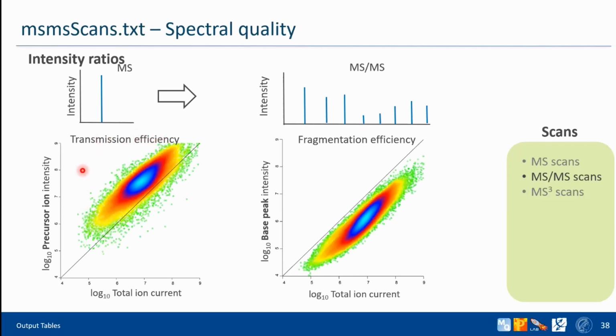Okay, so we have a higher one going toward MS1, here MS2. They should be on this exact line here. So it means that, for example, something happened during MS2 and you were identifying more stuff, more contaminants, more something that was not supposed to be there, or maybe something bad happened before MS1, when you were doing the liquid chromatography. So maybe you want to put less data in your mass spectrometer when you see this kind of stuff.